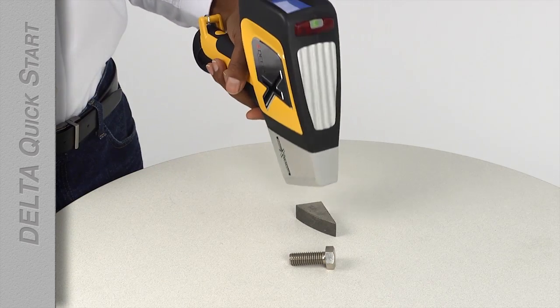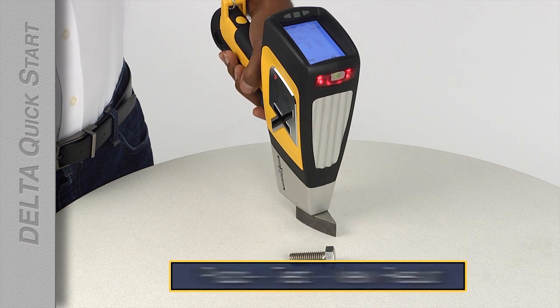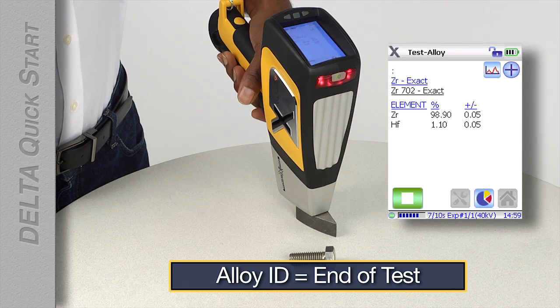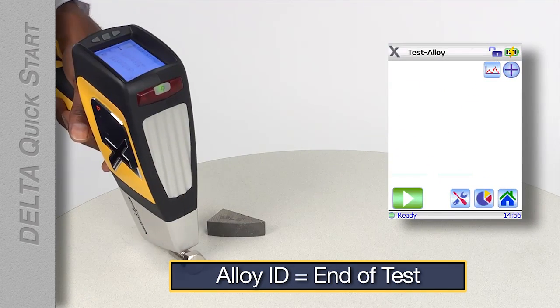Testing is a short, simple, three-step process: Place. Test. View the result. Your Delta is configured to end testing when an alloy has been identified, so you don't have to determine when a test is ended. As soon as your test is over, you can go on to the next test.